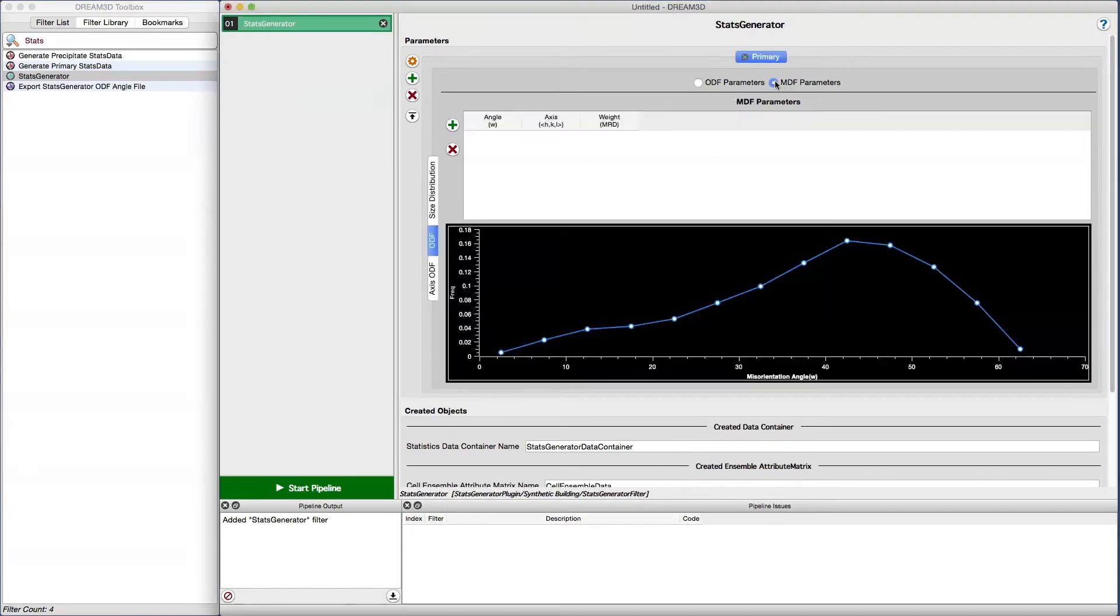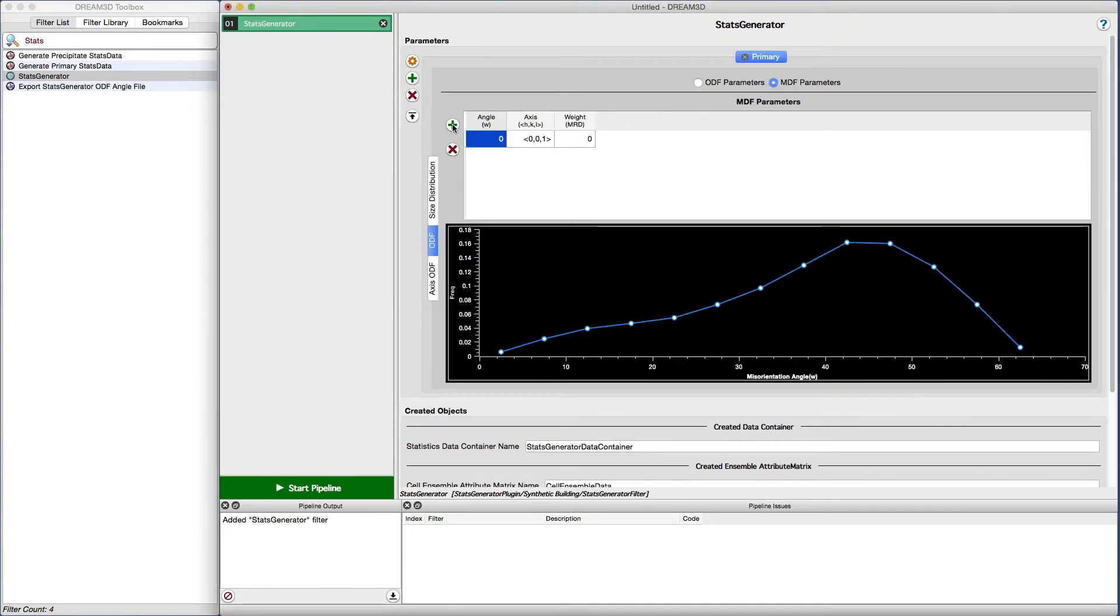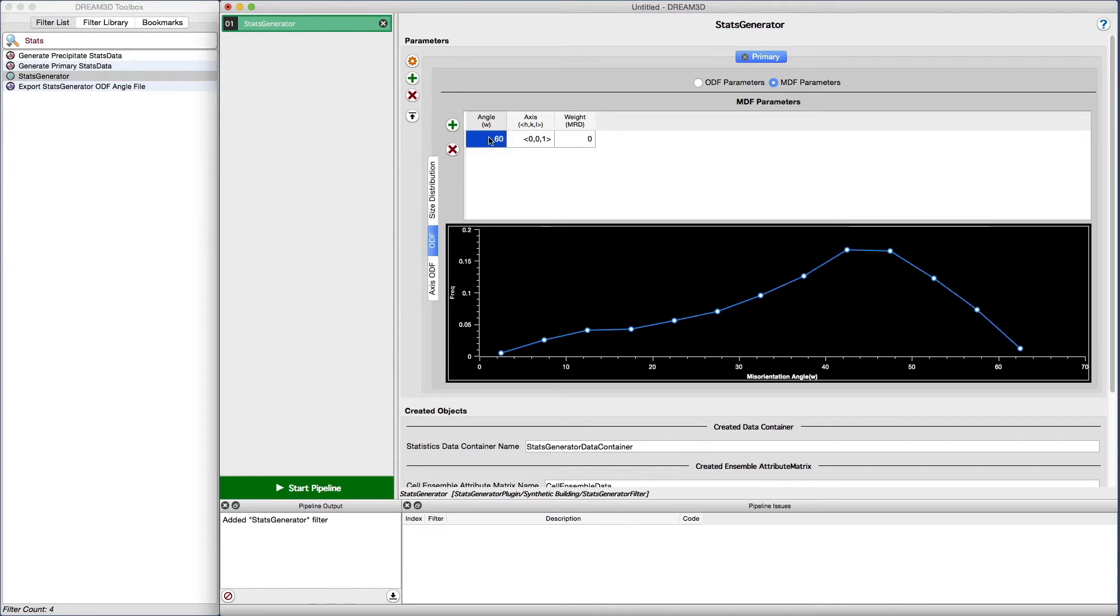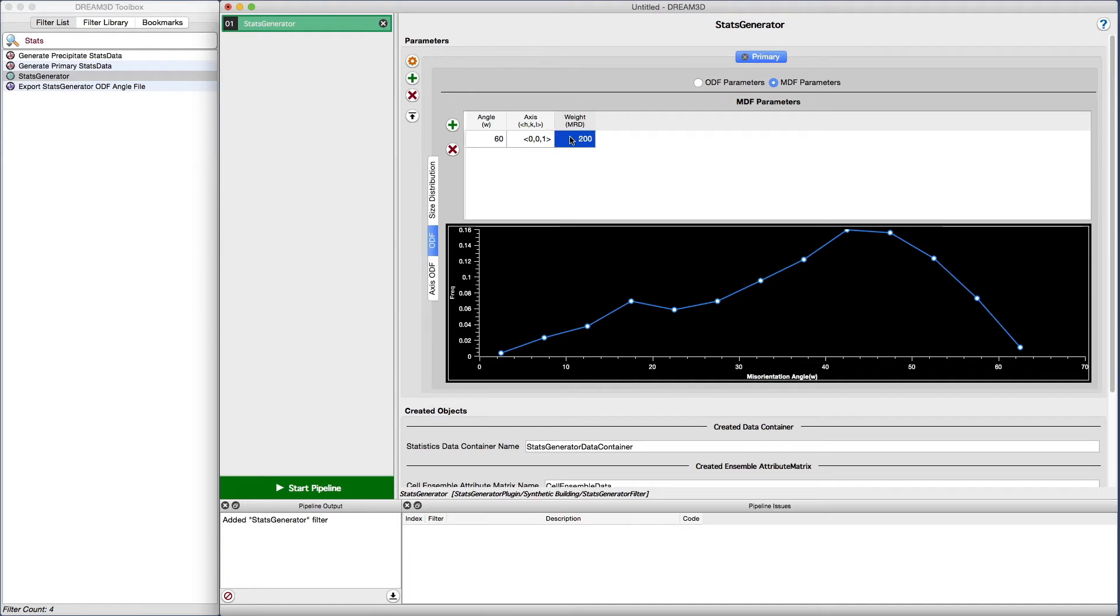Another option the user has to tailor the crystallographic properties of the synthetic microstructure is to adjust the misorientation distribution function or MDF. The user can click on the MDF radio button to display the MDF properties. Editing these properties works in the same way as the ODF parameters. Click the add MDF weight button to add an entry into the table.